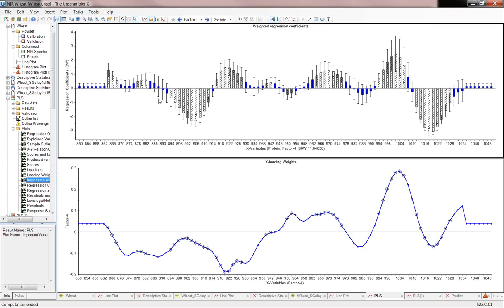If that variation crosses 0, then it's saying that sometimes the loading is going positive as you're increasing in protein, and sometimes it's going negative as you're increasing protein. So it's not considered an important variable. That is one way to help you choose. Again, you have to make your own decisions yourself. Don't let chemometrics be a black box.